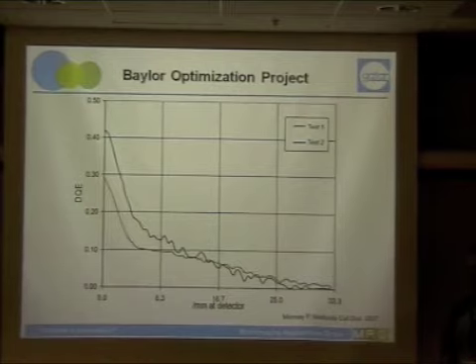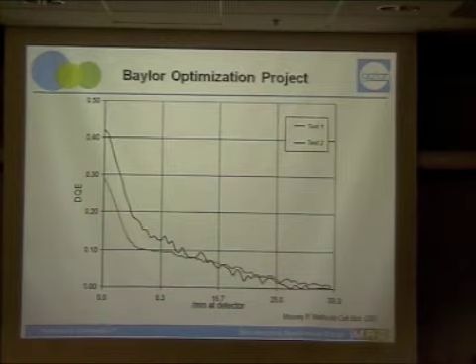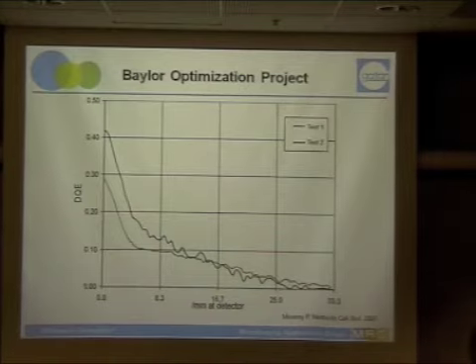We started doing an analysis, plotting the number of asymmetric units for single particle analysis against resolution. We haven't finished that analysis, but some of the studies that came out were quite interesting in the sense that some of the CCD cameras seem to require a lot less than film. Can anybody else comment on that? The CCD cameras require less what?